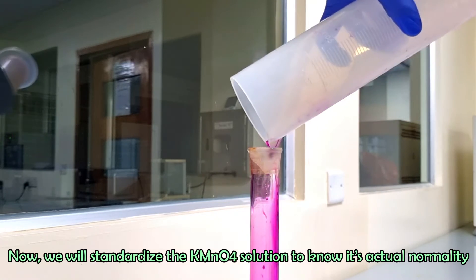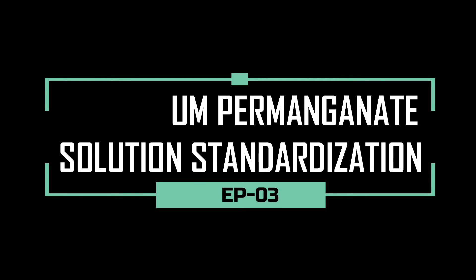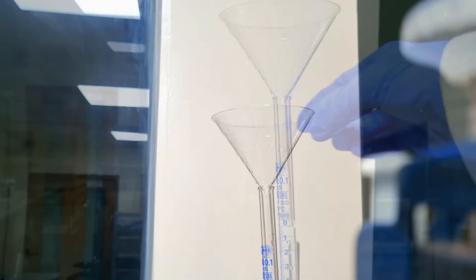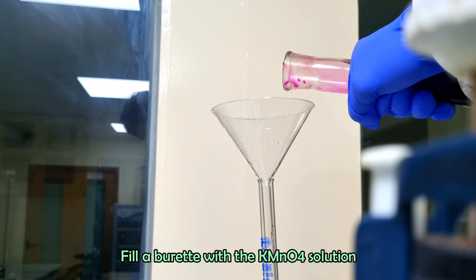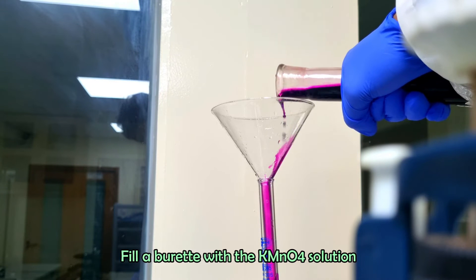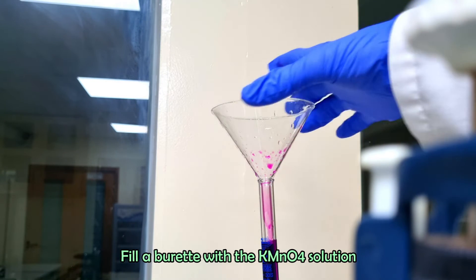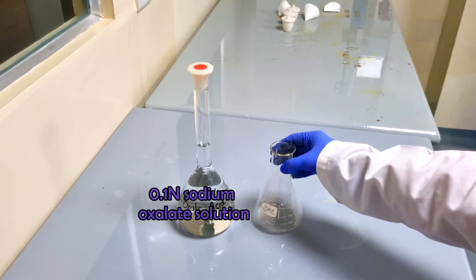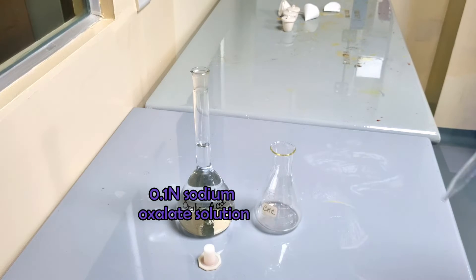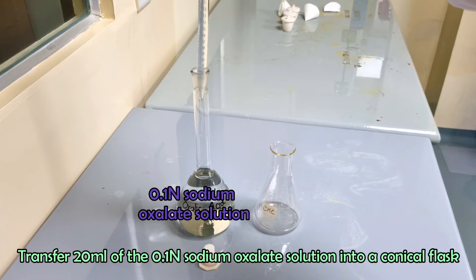We will standardize the potassium permanganate solution to know its actual normality. Fill a burette with potassium permanganate solution. Transfer 20 ml of the 0.1 normal sodium oxalate solution into a conical flask.